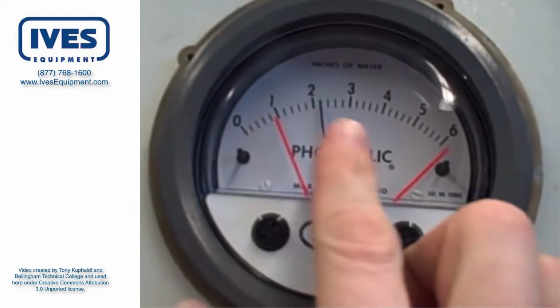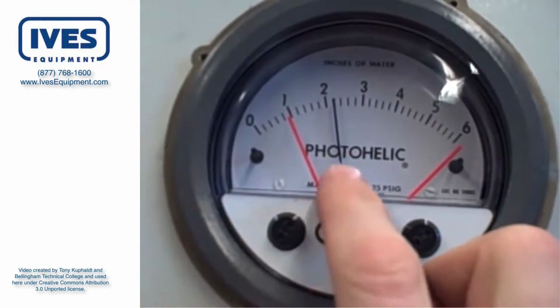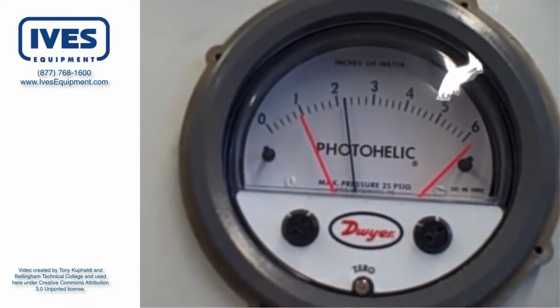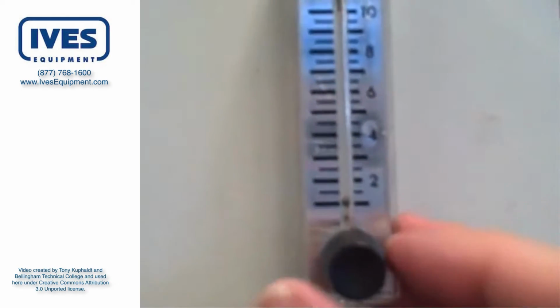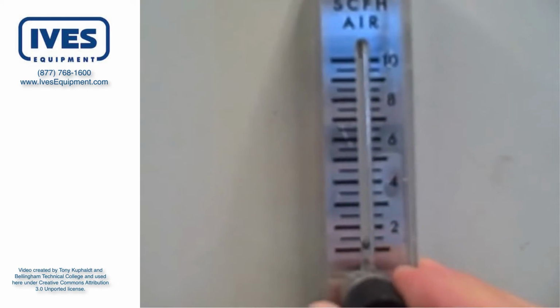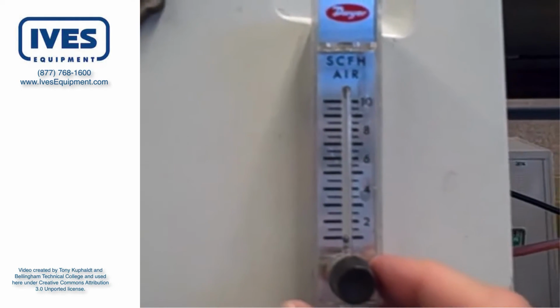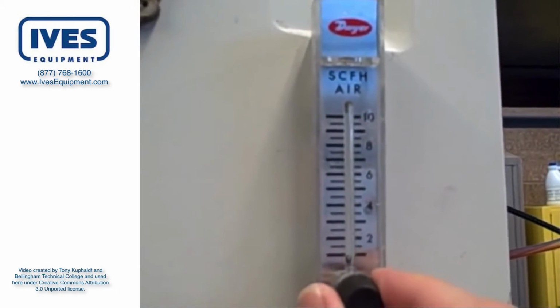And you can see here, if you look closely at the Photohelic gauge, you can see the needle bounce back and forth. That's because of the individual bubbles exiting the end of the bubble tube. So I could look at the bouncing rate of that as a crude indication of flow rate. However, we do have the Rotameter here that serves as a secondary indication, or primary if you rely on this more, and that's its purpose in this application. So that's what a Rotameter does, that's what it's used for, and that's how it works.